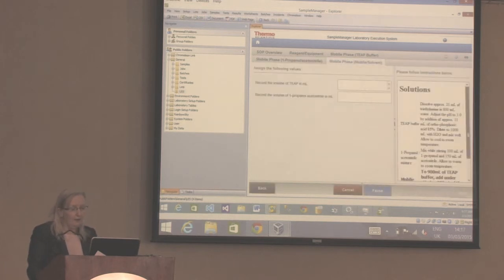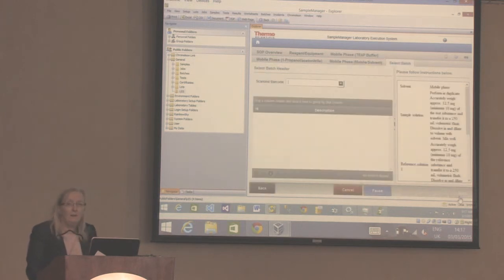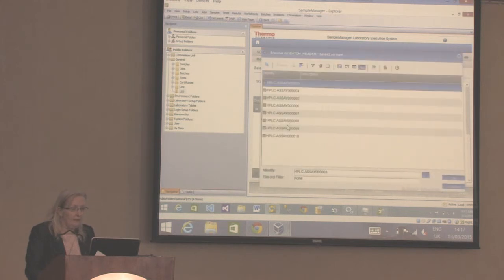Because the other thing is, if you do want, you can look at the process history as you're going through the method. You can display the process history as you go through it as well. You don't have to wait until the method is completed. Yes, you can make them mandatory.